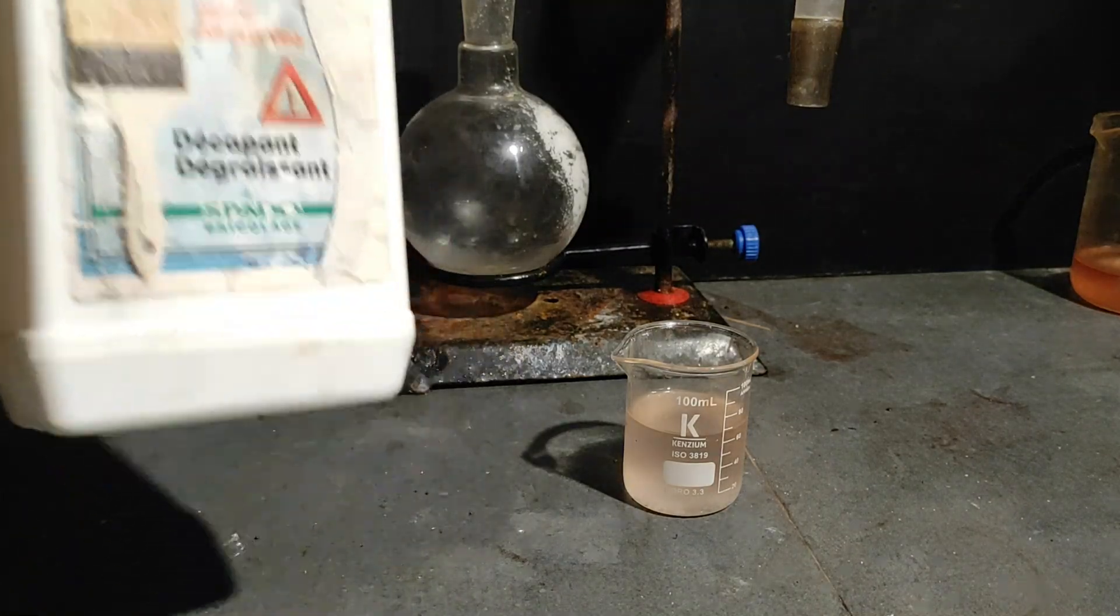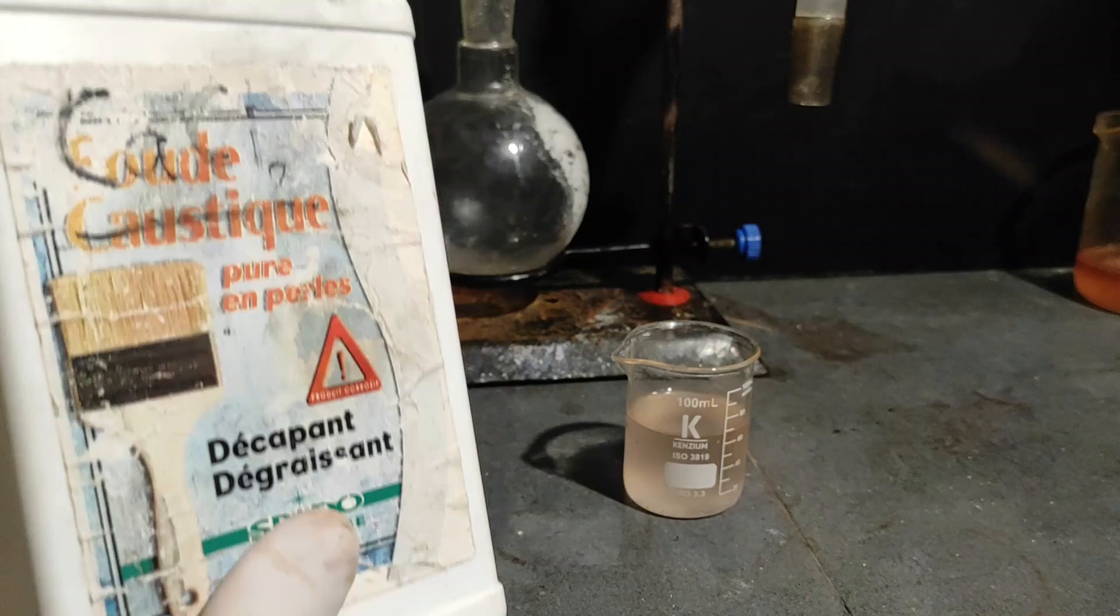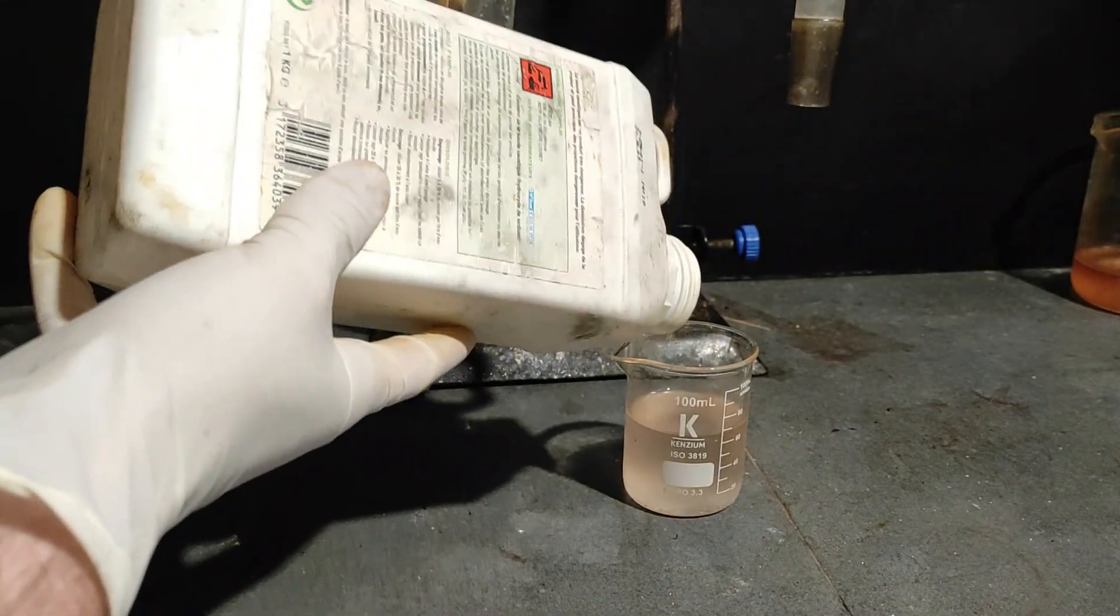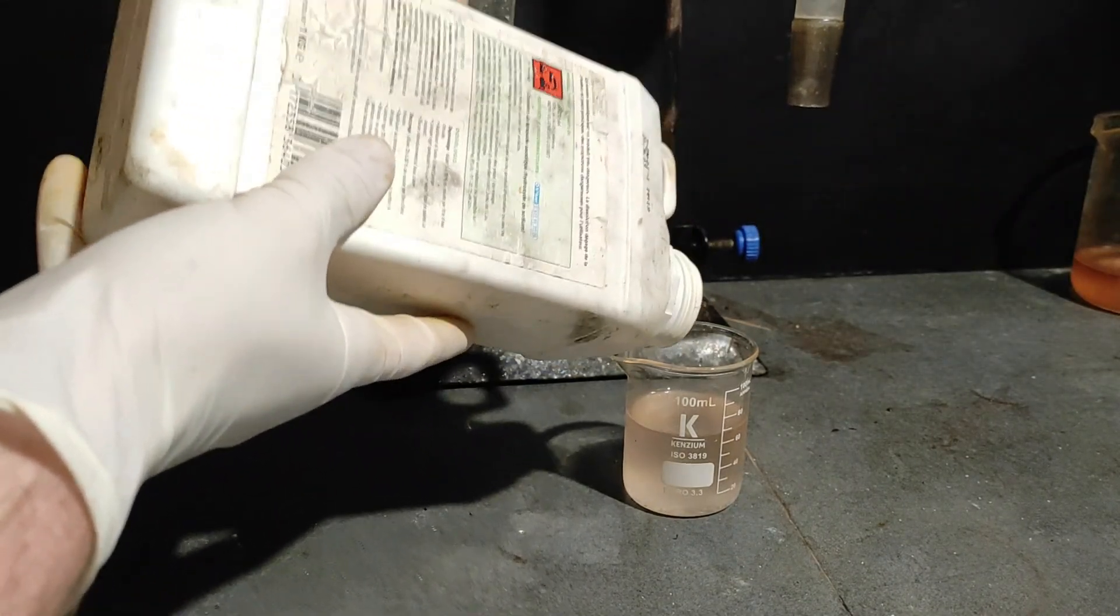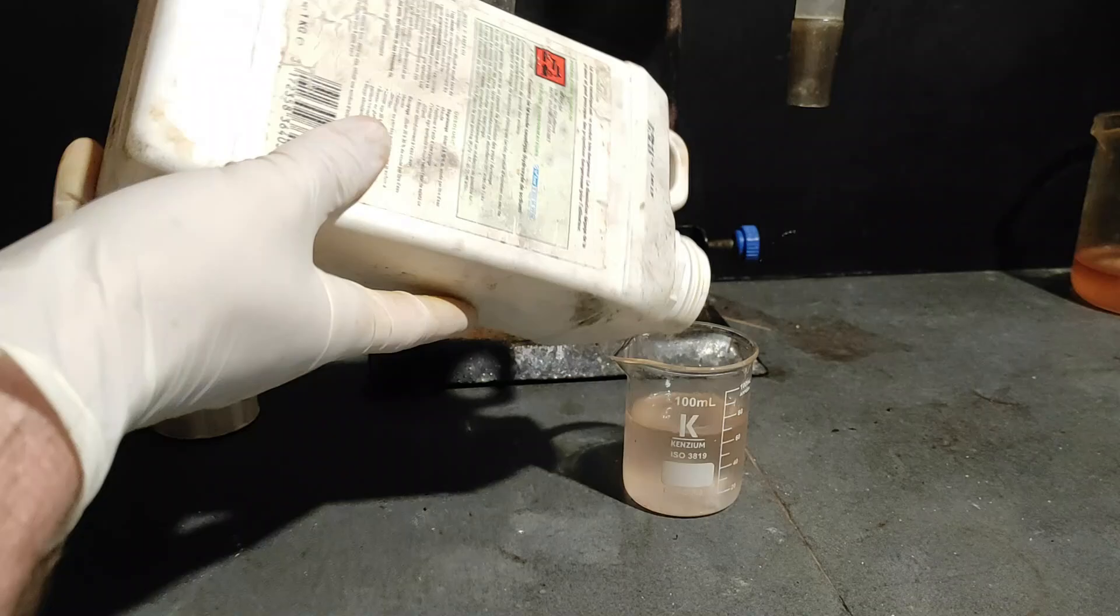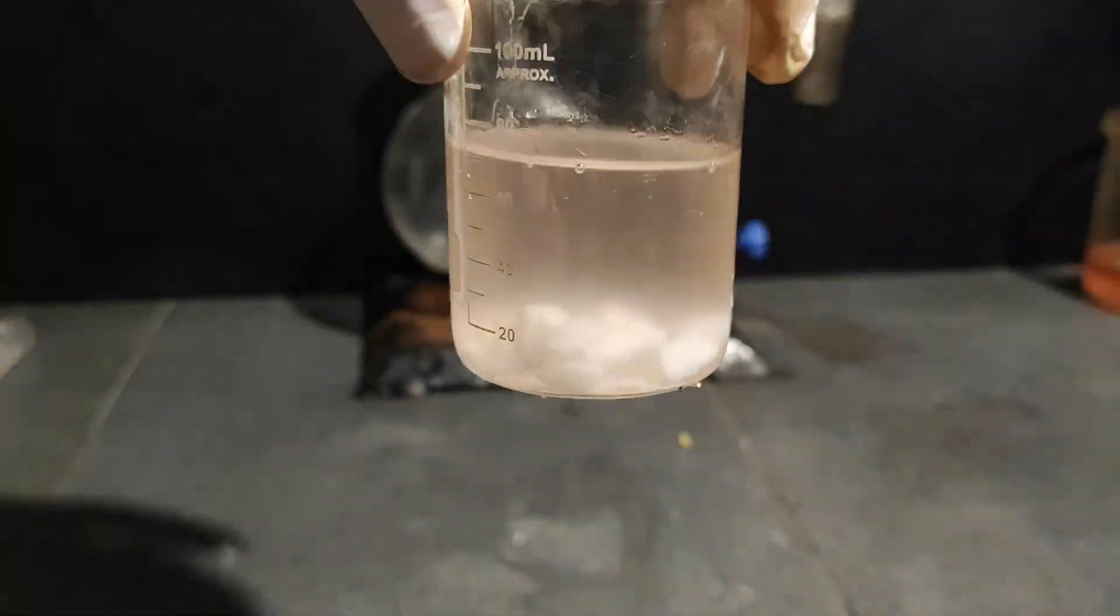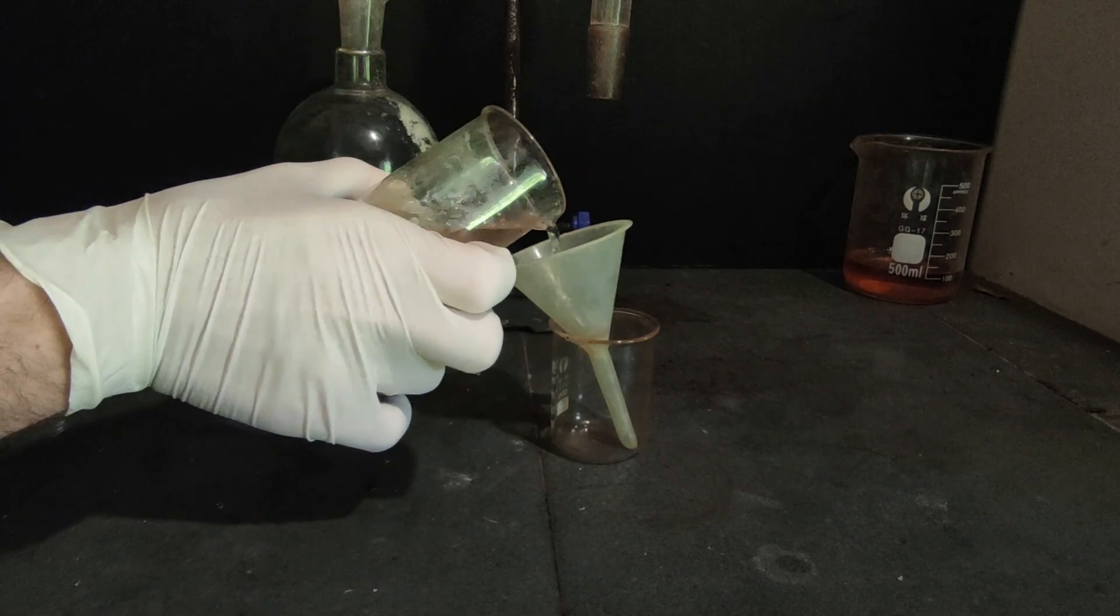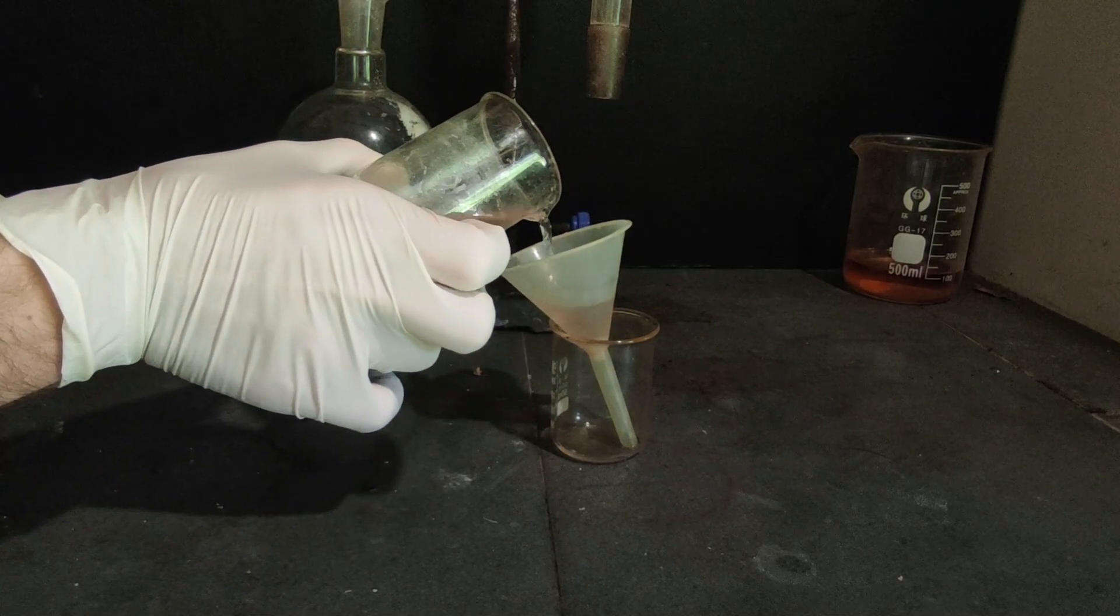Now to get rid of any water at all that might be present in our DCM we're gonna add a random amount of anhydrous calcium chloride which will hold onto any water molecules present. I let it sit for a few hours and the solution looked much clearer after a quick filtration.